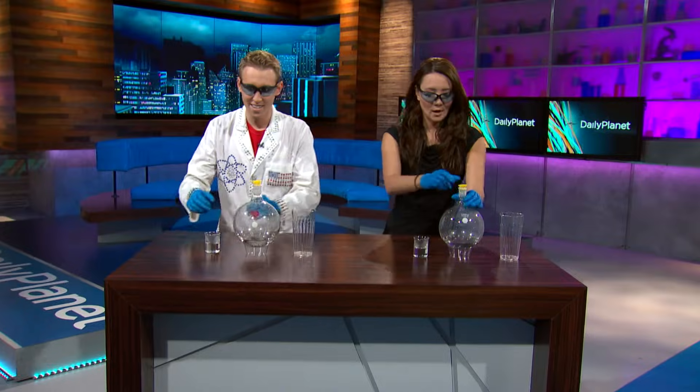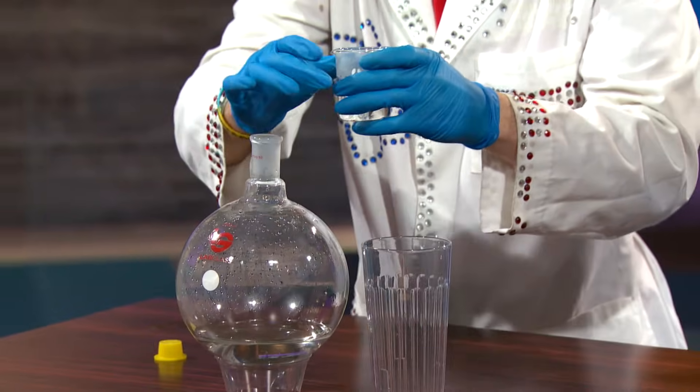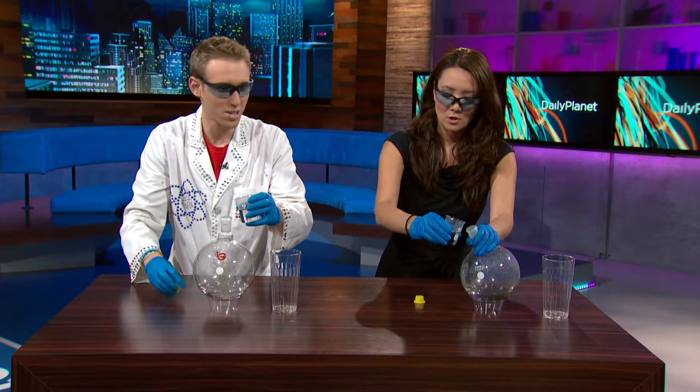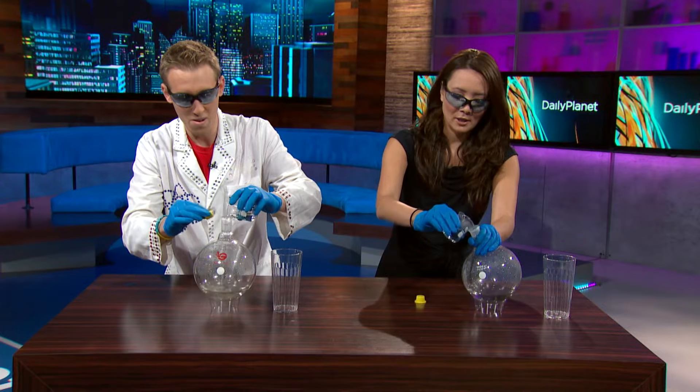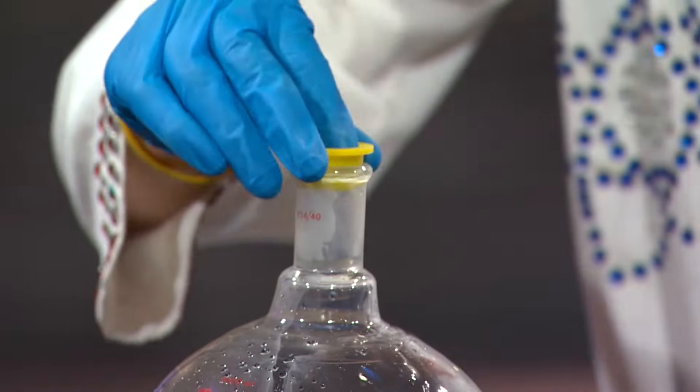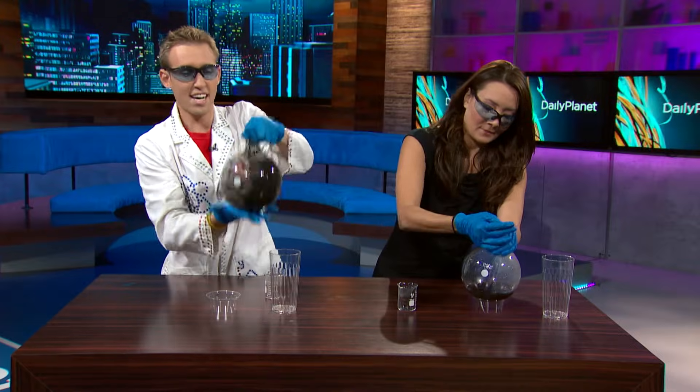Okay, uncap it, take the sugar water, and on three — pour it fast, then cap it and really shake it. Go! Cap it, and now shake it!